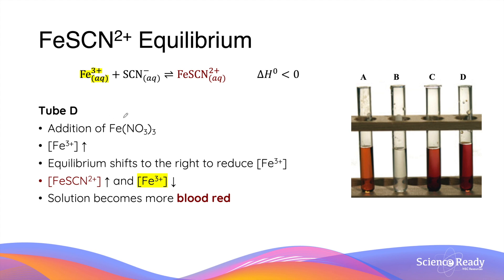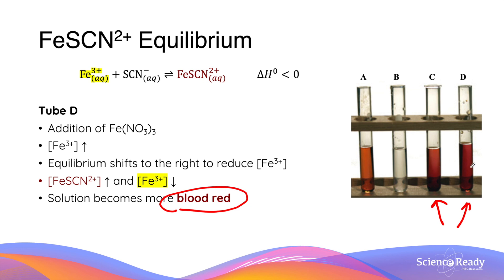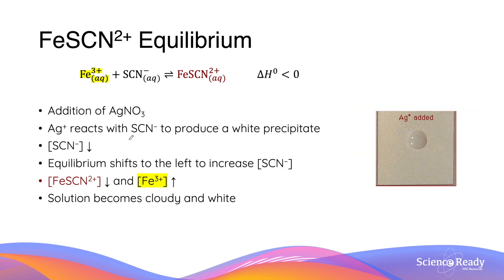In test tube D, we are adding iron nitrate, which increases the concentration of iron 3+ ions. Like before, this shifts the equilibrium to the right in order to reduce the concentration of iron 3+. This causes the concentration of iron thiocyanate ions to increase and iron 3+ to decrease, making the solution appear more blood red. Looking at the diagram, the colours of test tubes C and D look very similar.